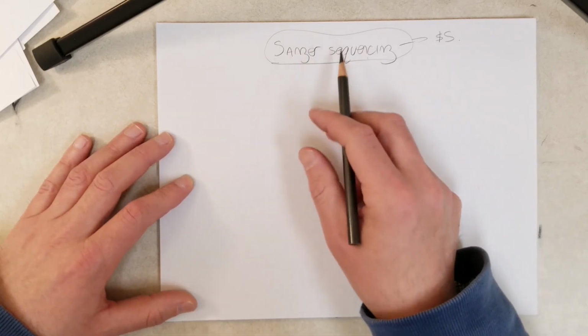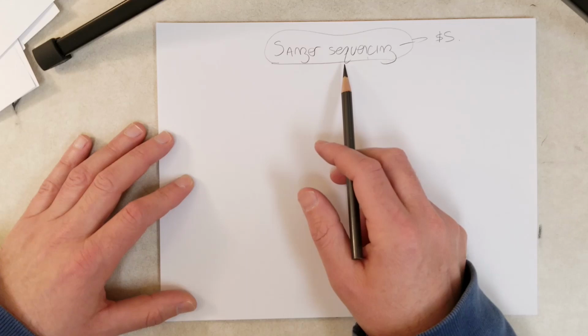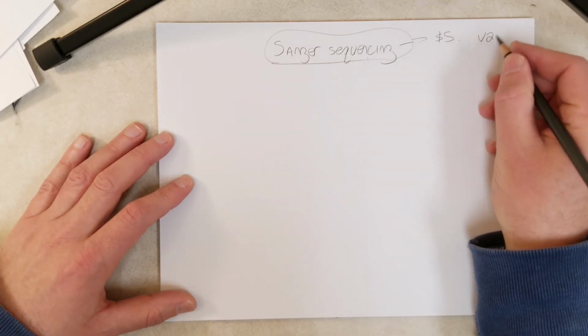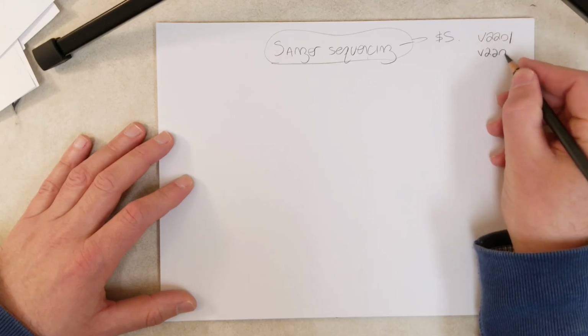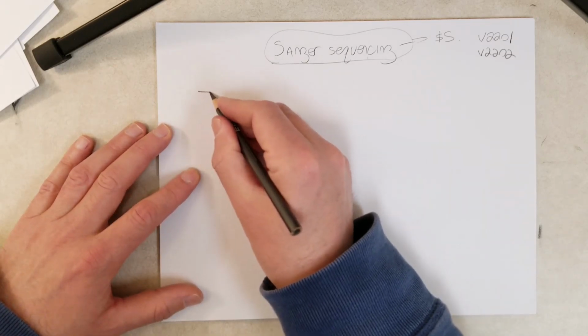So you kind of need to understand how PCR works. Some of the concepts are the same, so make sure you understand how PCR works by watching the previous video. The PCR video was V2201, I believe, and this one is going to be V2202. So, okay, Sanger sequencing.